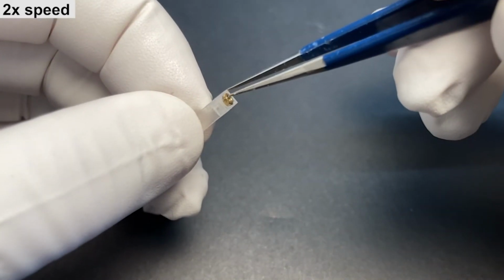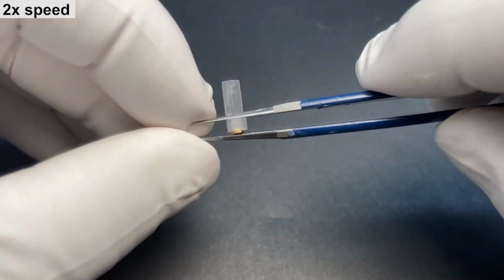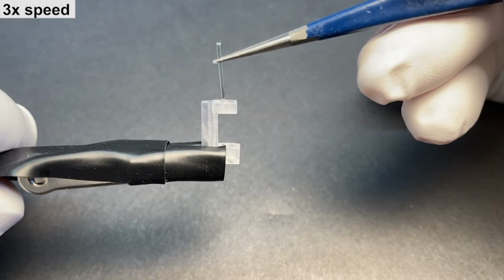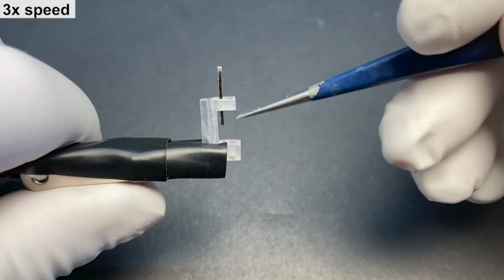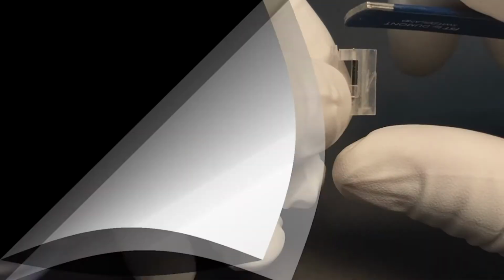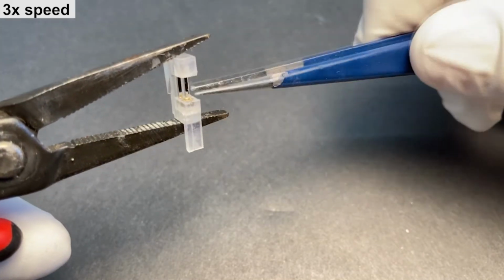And then we will insert another nut into the arm. And again, the main purpose of this is to have a metal to metal connection instead of a metal to plastic connection. And this is one other feature that we added to the original design. We added these two metal bars, and this will help to smooth the movement of the arm and also prevent any lateral movements. Once you insert the metal bars into the drive, you need to remove them a little bit and then glue them in place.